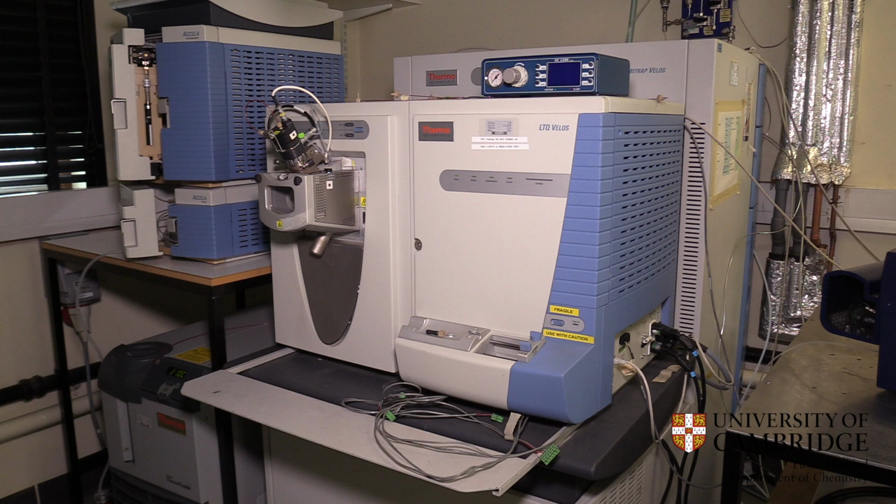It's a high-resolution mass spectrometer. So high resolution means that with these instruments we have the ability to measure very small differences in the mass of single molecules. So for example, if you have two molecules of very similar mass, with high resolution instruments you can distinguish these two molecules, while with low resolution instruments you cannot. And we use this instrument for air pollution studies.